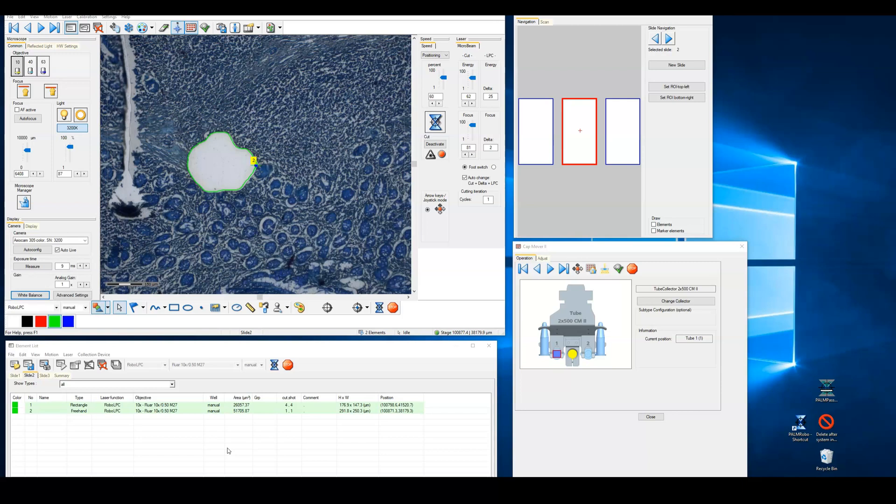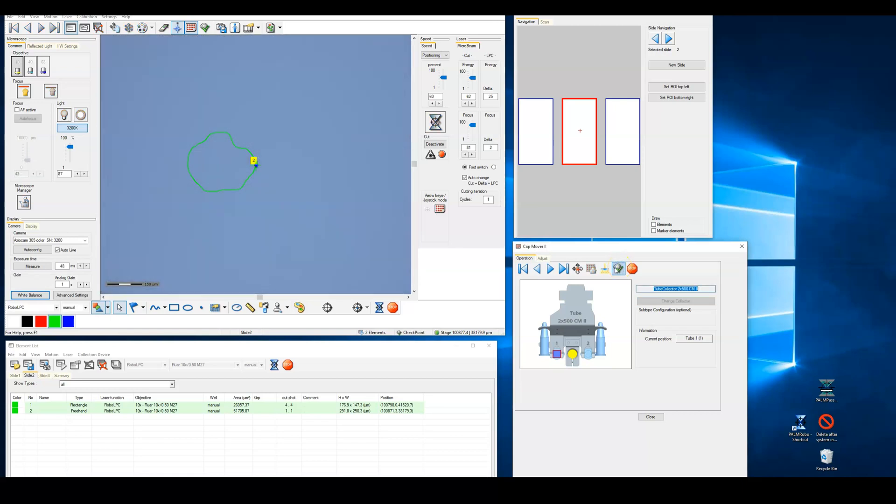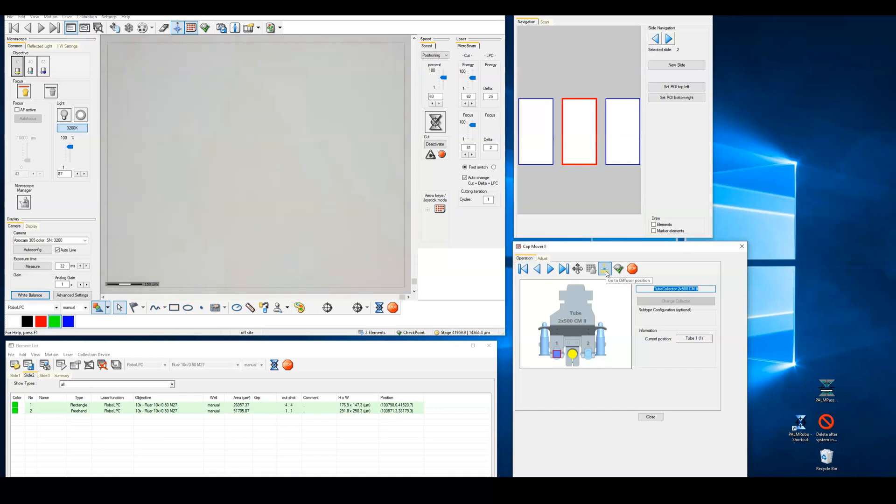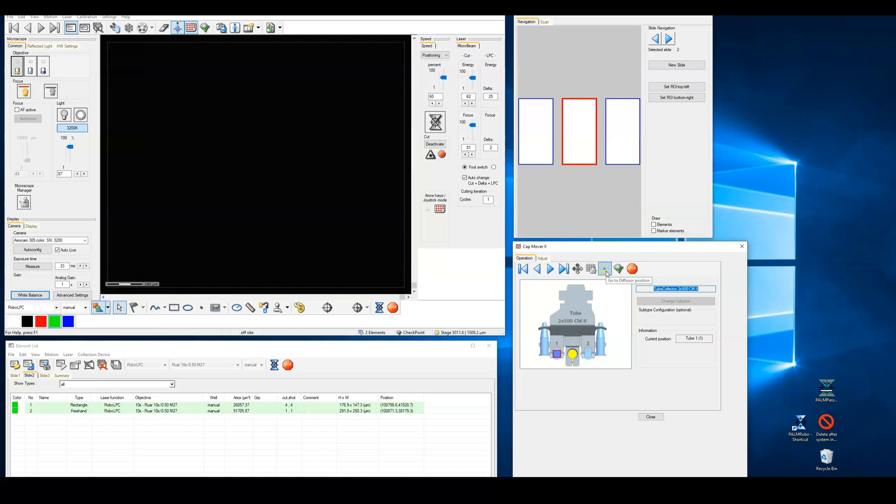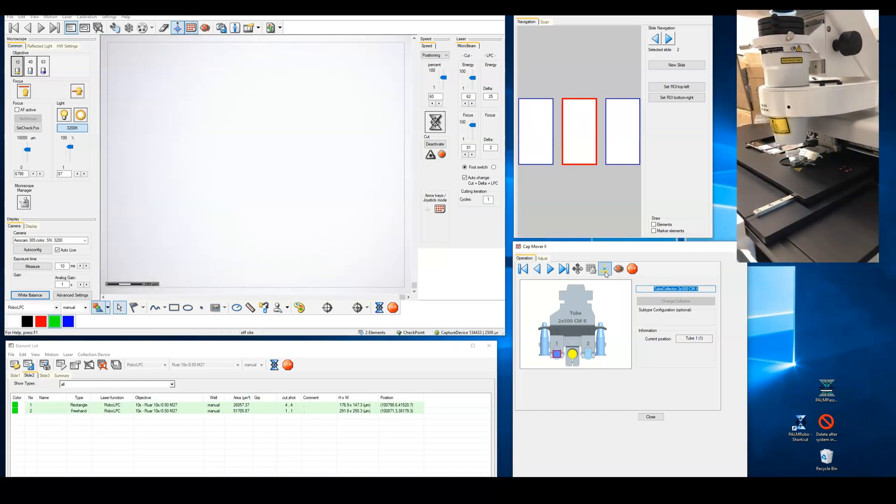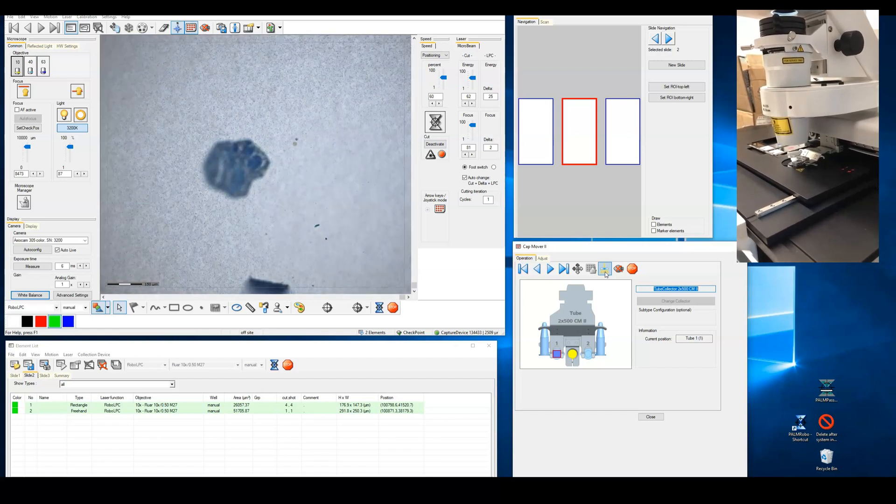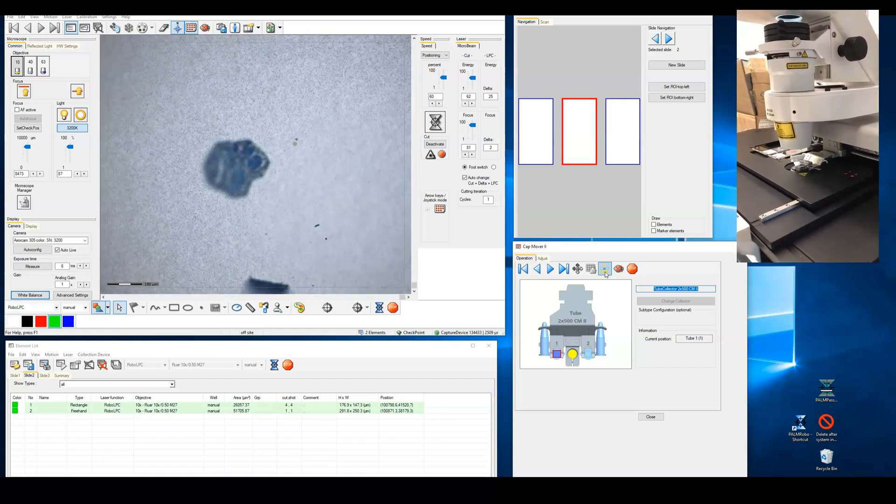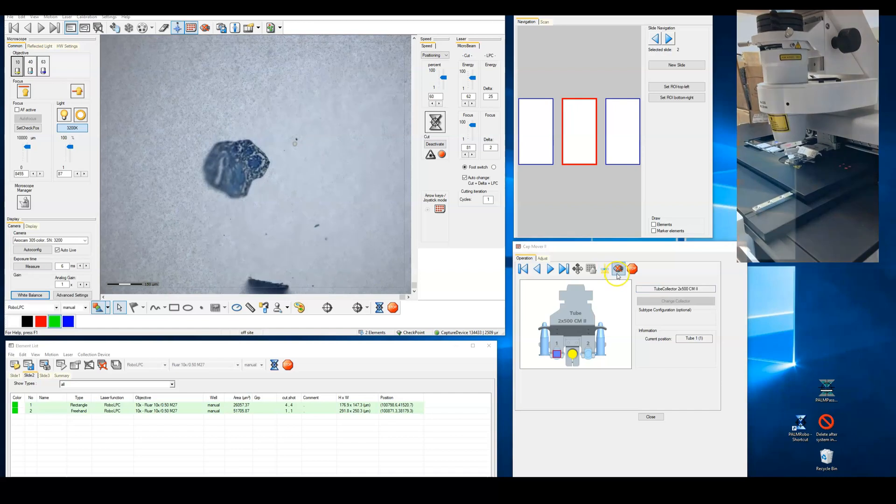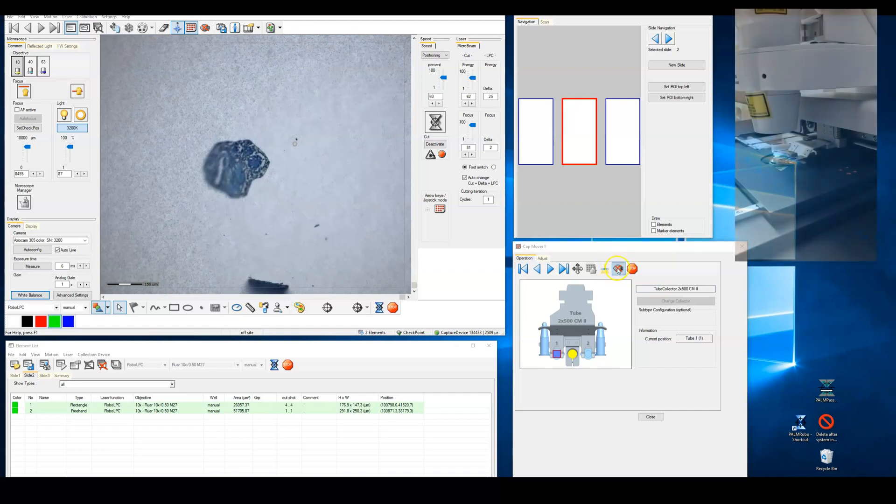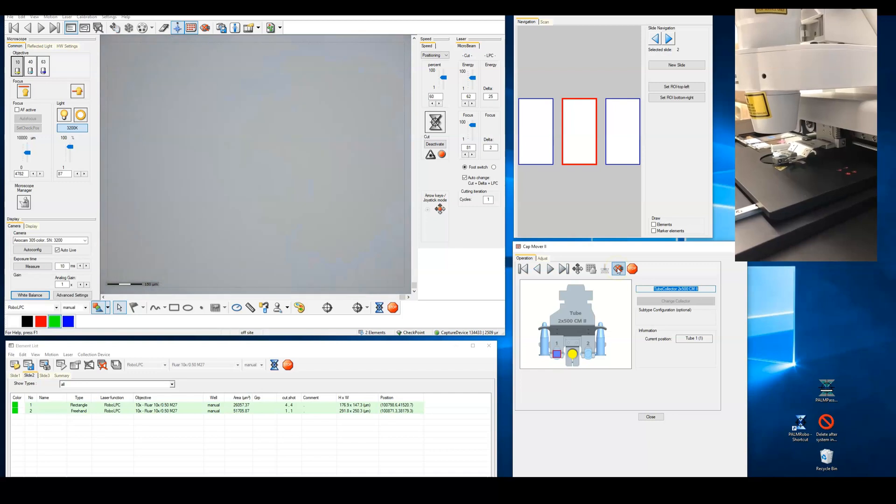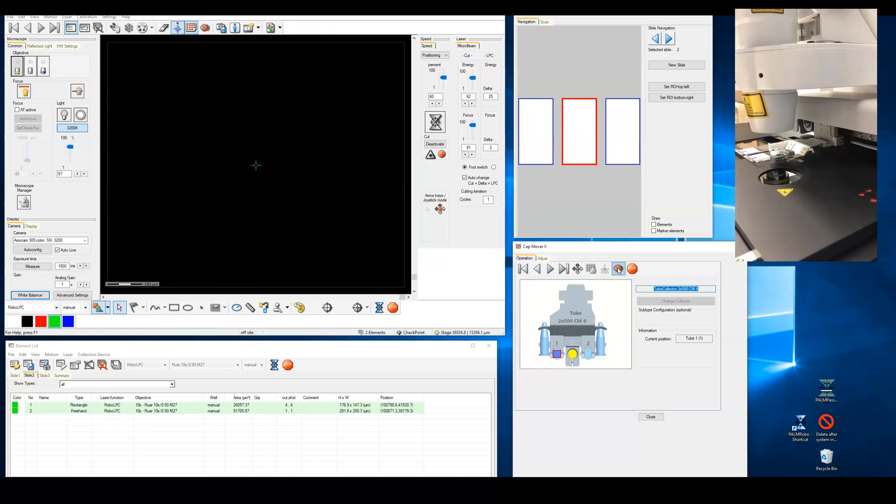We can view the sample isolated in the capture tube by clicking on the check cap button on the capture device window. It's best to use the lowest possible magnification when checking the cap to speed the finding of the sample. Clicking on the check cap button will move the stage to a position where the microscope slide is out of the light path and the objective should be automatically focused on the capture cap. Click on the same check cap button, which now has a red X through it, in order to return to the regular stage placement and resume isolation of tissue.